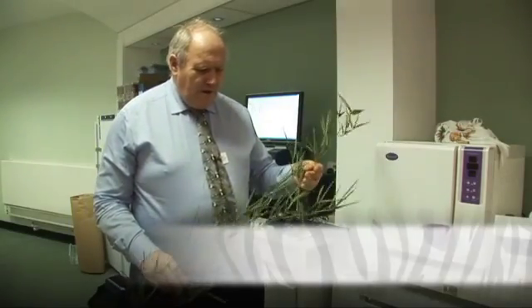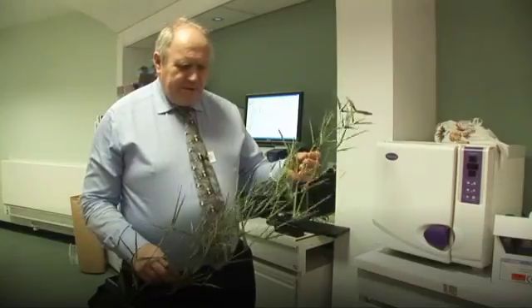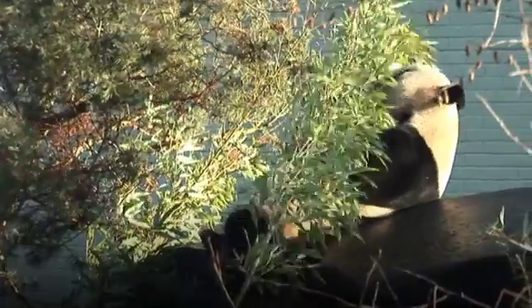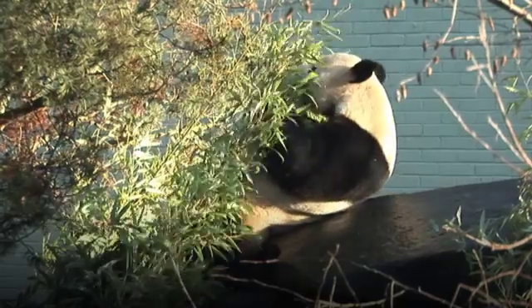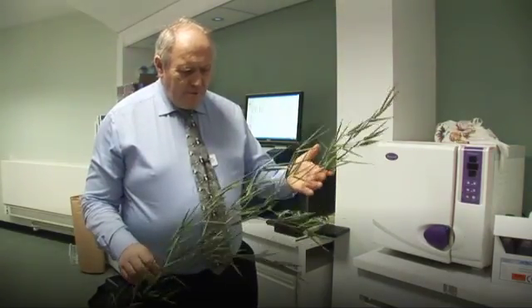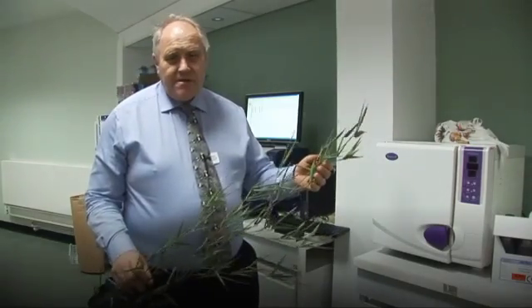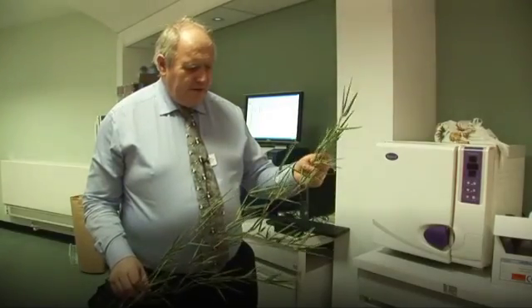You can see in my hand here a sample of plant material. This happens to be bamboo, and this is the type of material that is obviously fed to the pandas here, but it could equally be a sample of hay, lucerne, or some other forage material. We start with this and our main aim is to process it into a form that we can successfully analyse.